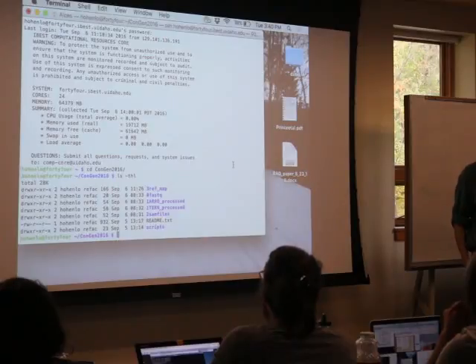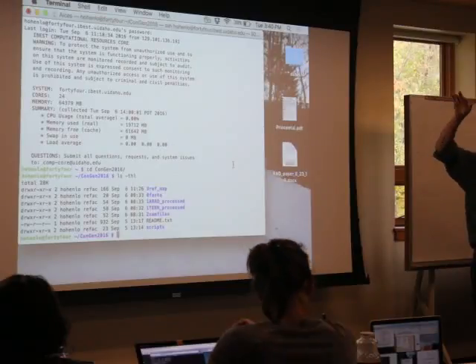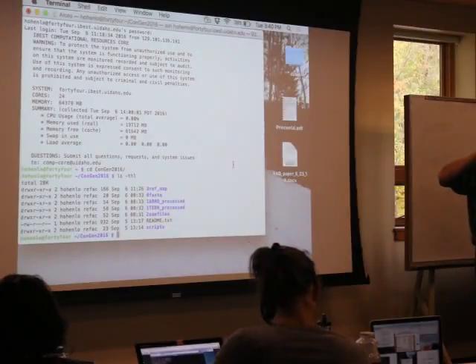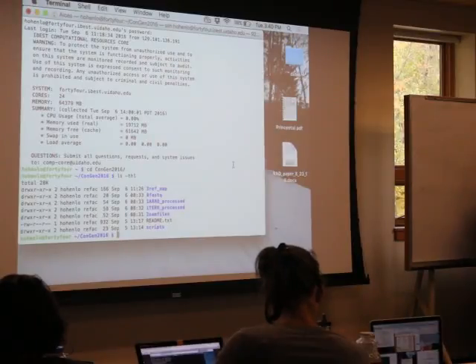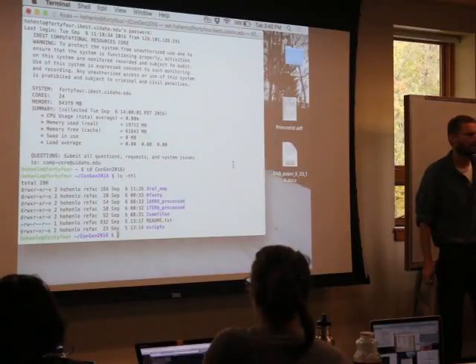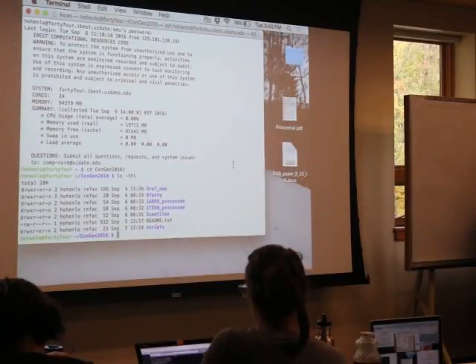What I would encourage you to do is just sort of play around with these different parts of Stacks. Like I showed you on that little workflow, you can start from any point and go down from there, and try out the next step. Things like P stacks and U stacks will work per individual. So if you just have the one individual FASTQ file, you can run U stacks on the FASTQ or P stacks on the SAM file.